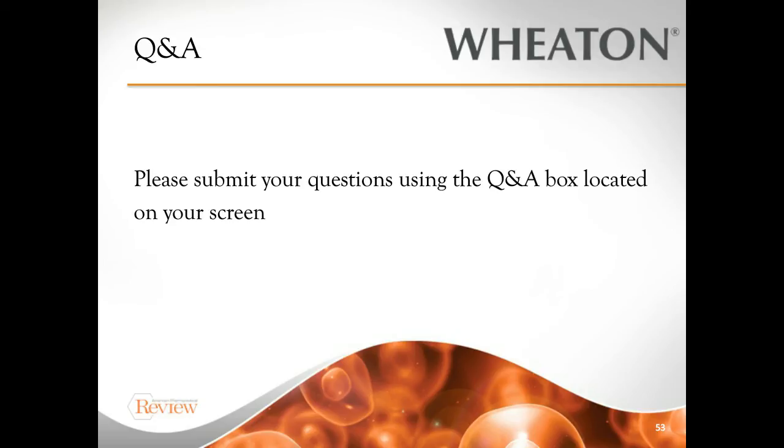Great! Another great question. Yes, COC, and it depends. Gamma radiation will. We found that, and it's dependent on where you're getting the resin from. And the thing is, there's not too many manufacturers of cyclic olefin copolymer resin. However, it is dependent on what is put into the resin, but yes, when you gamma irradiate COC, you can have it change a yellowish color.